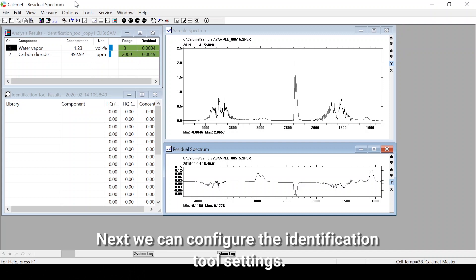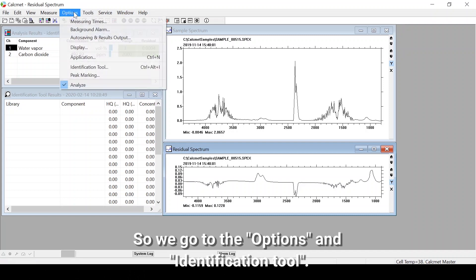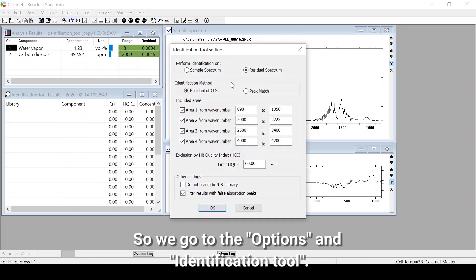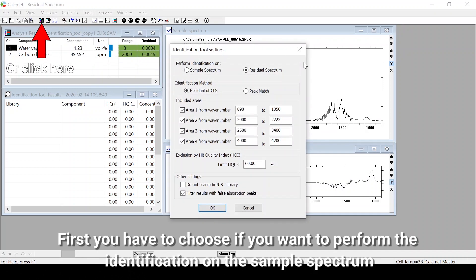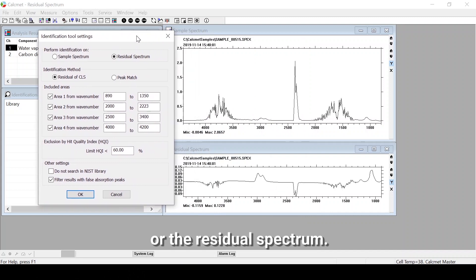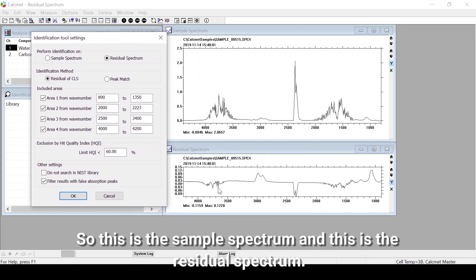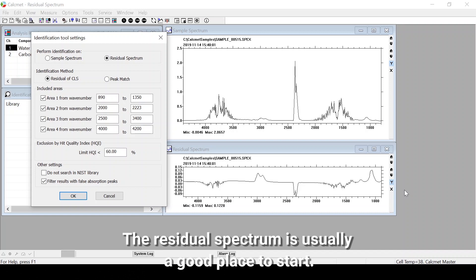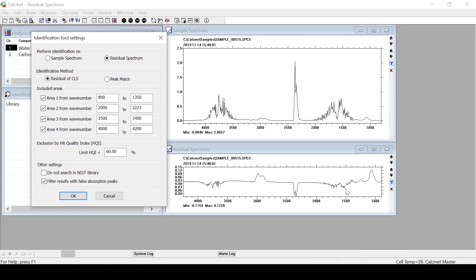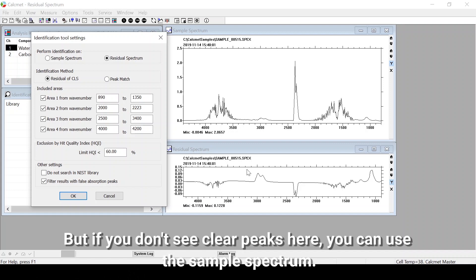Next we can configure the identification tool settings. Go to Options and Identification Tool. First you have to choose whether you want to perform the identification on the sample spectrum or the residual spectrum. The residual spectrum is usually a good place to start, but if you don't see clear peaks there you can use the sample spectrum.